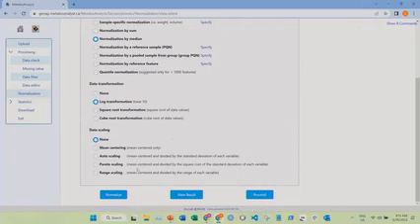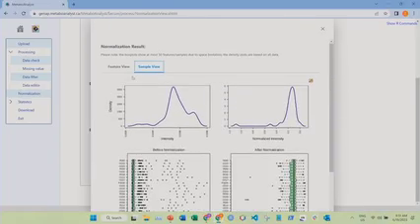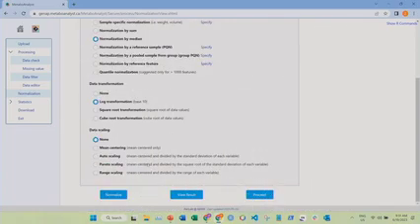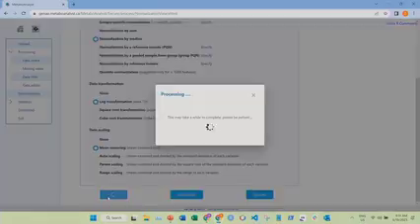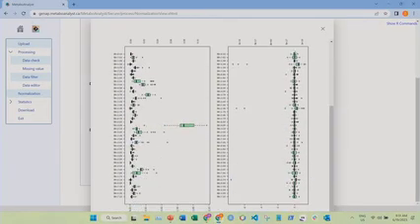Okay, and then scaling. Again, you can mean center, which is where you line up all of your features. You perform this on features. I can just show you again, if we look at the feature view, those should be all over the place. And then if we mean center, yeah, now these are much more aligned.